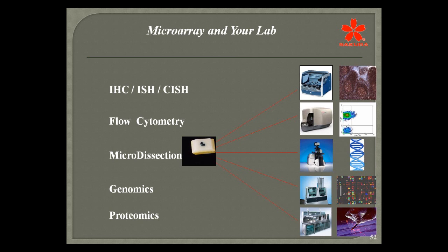And then as we go into the last two things that are really into the molecular realm, genomics and proteomics, we're seeing more and more of this today, and you're going to continue to see that. You're going to hear about fixing tissues in specific molecular fixatives to preserve things like RNA and DNA that will be used for all types of molecular assays. And we're going to see more and more of the specimen handling in histotechnology be aimed in this direction, because that's just how it's going to be.